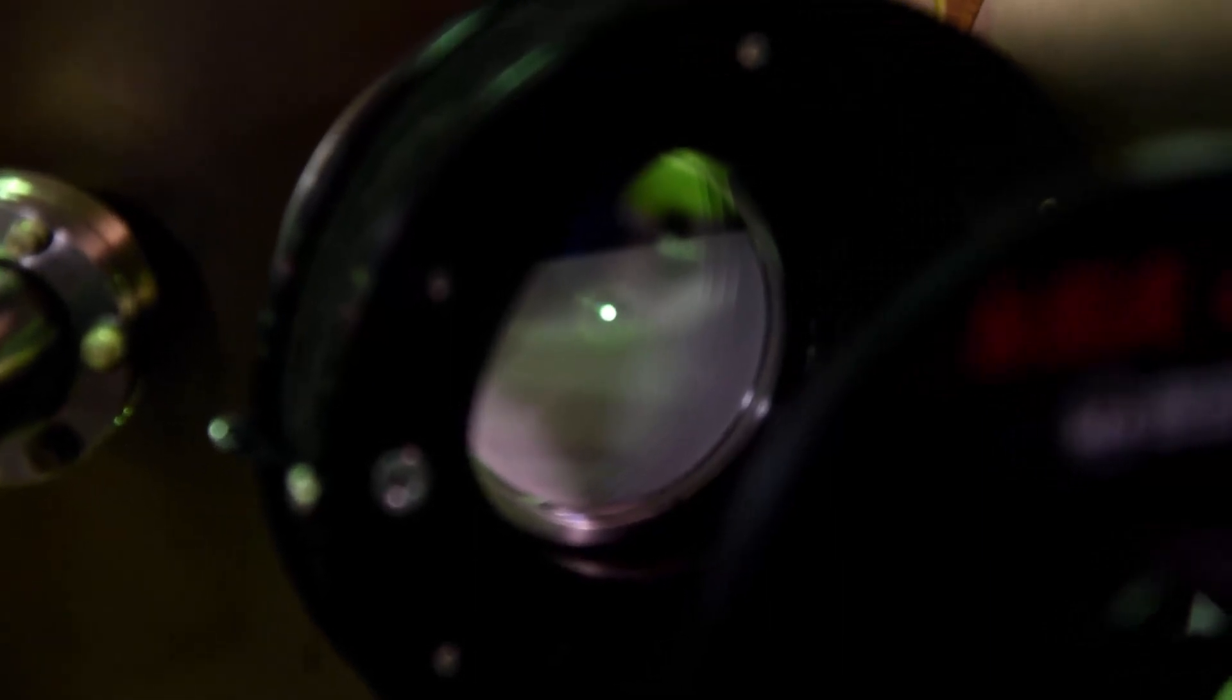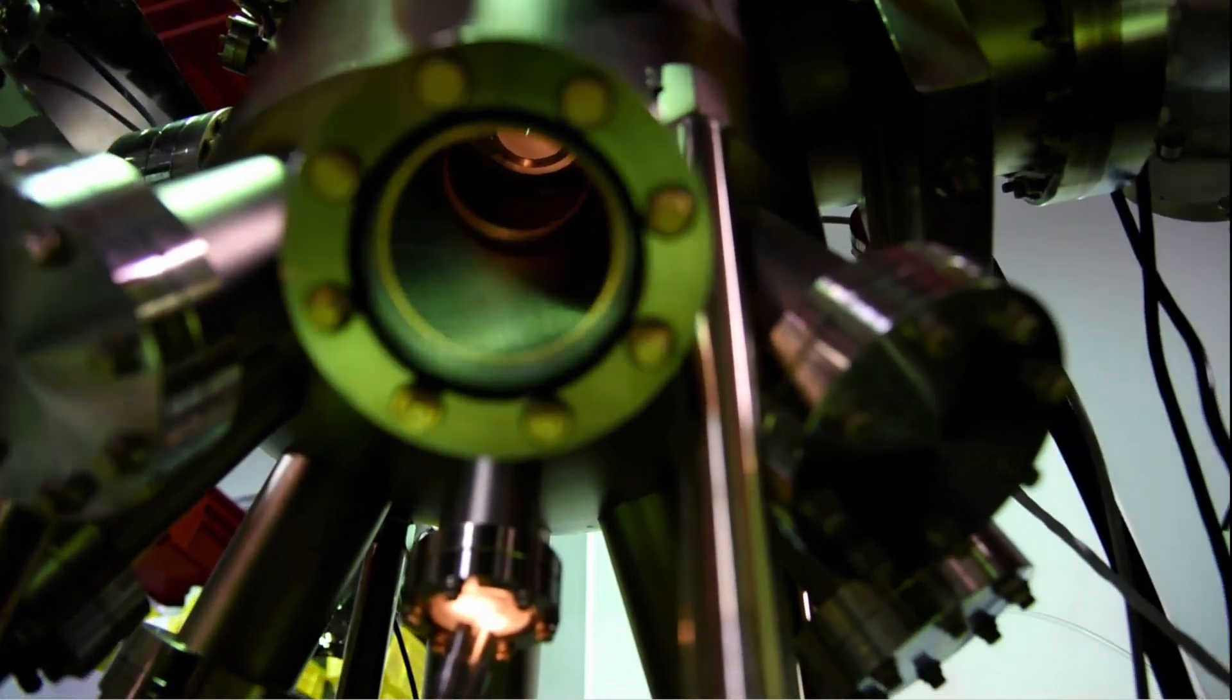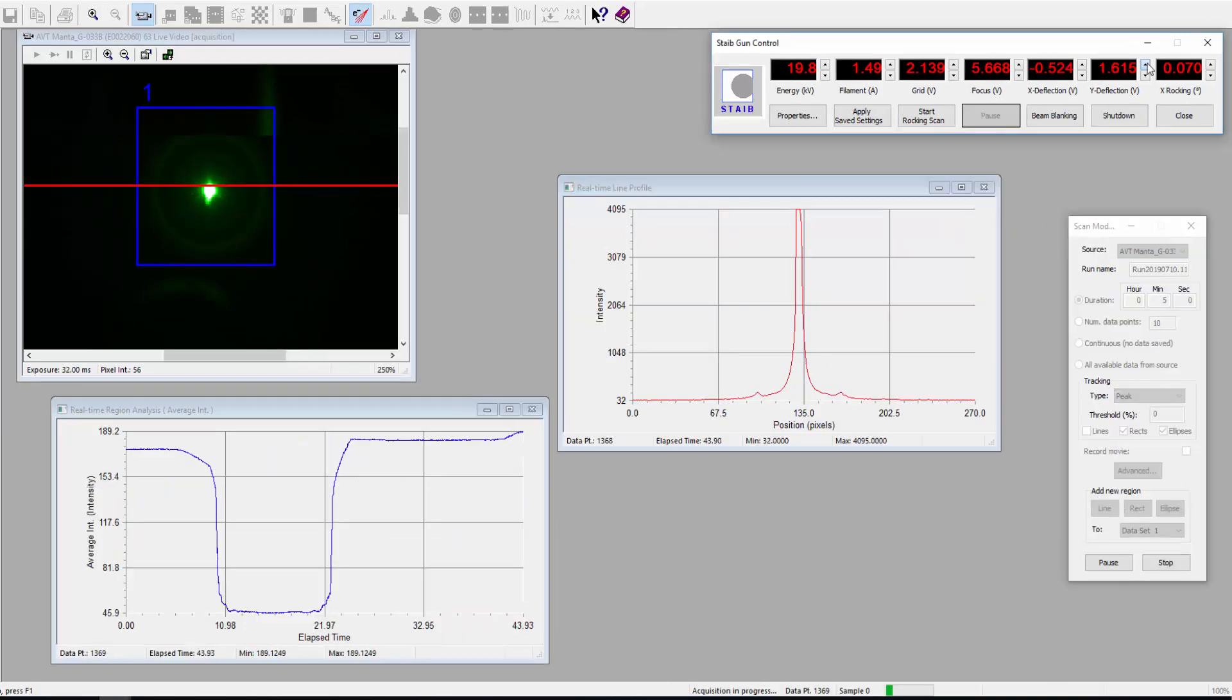When the straight through electron beam impinges on the alignment substrate, the phosphor fluoresces where the beam meets the substrate. As long as you have a viewport that allows you to see the substrate, you can see exactly what your beam looks like and where it is hitting the sample.